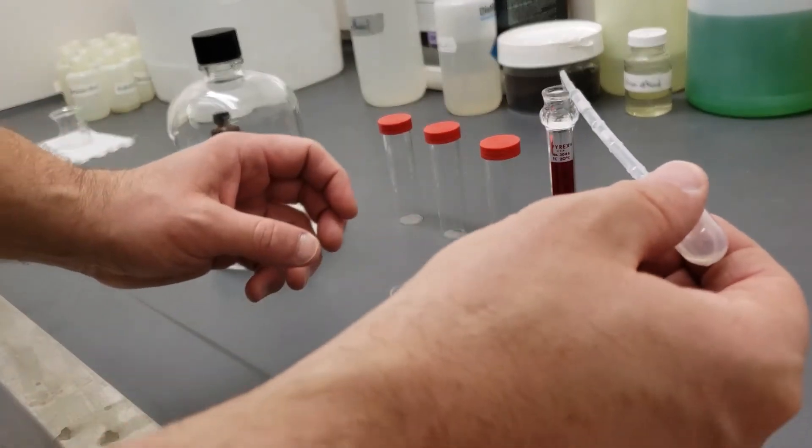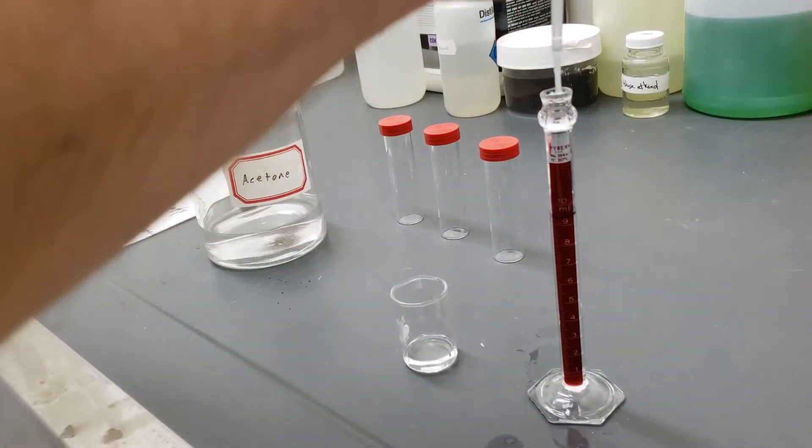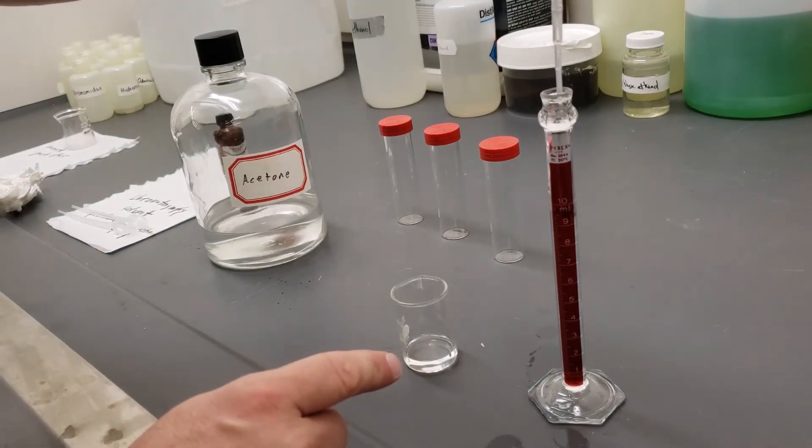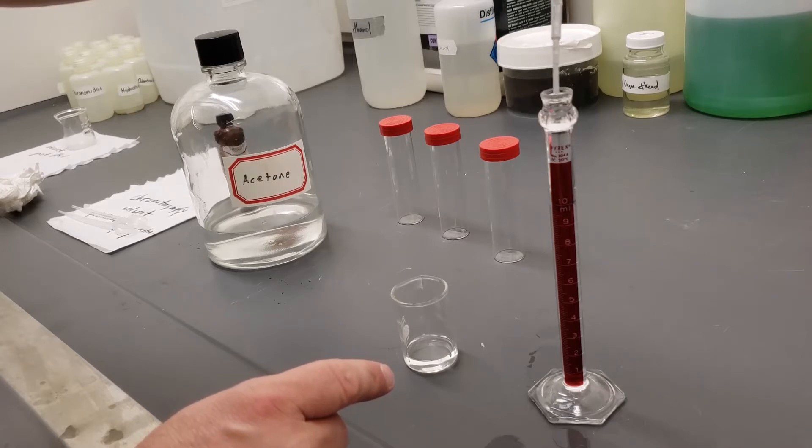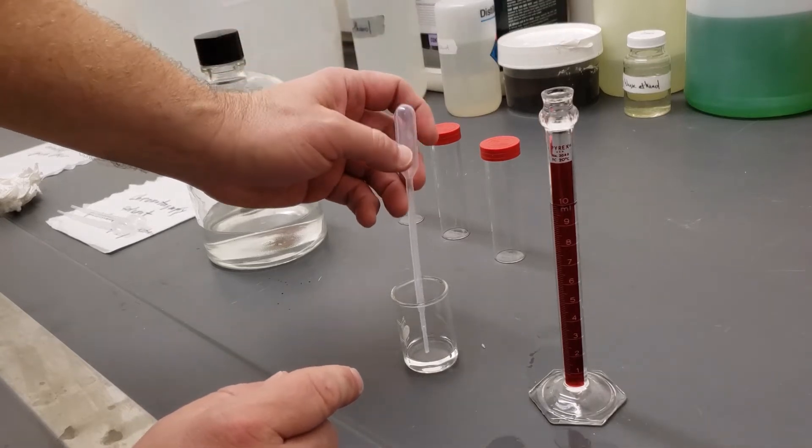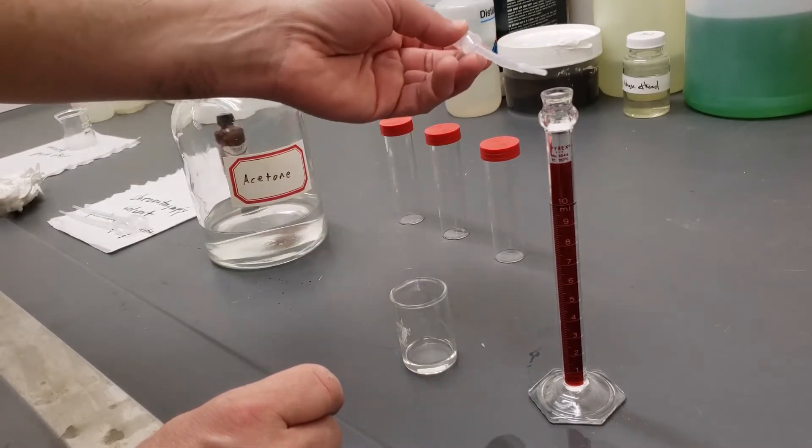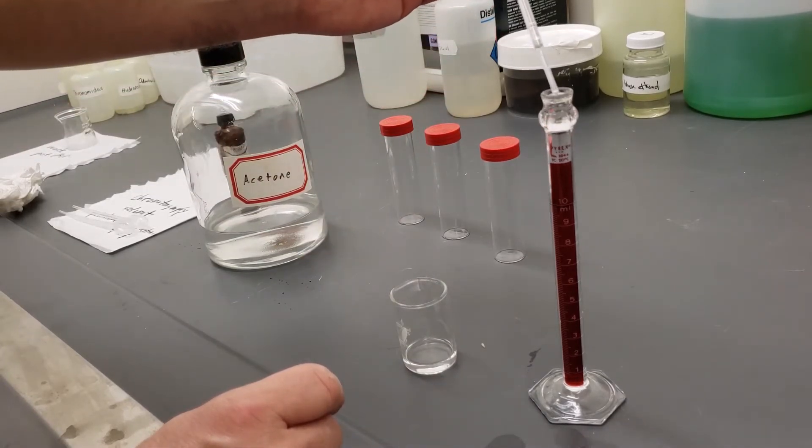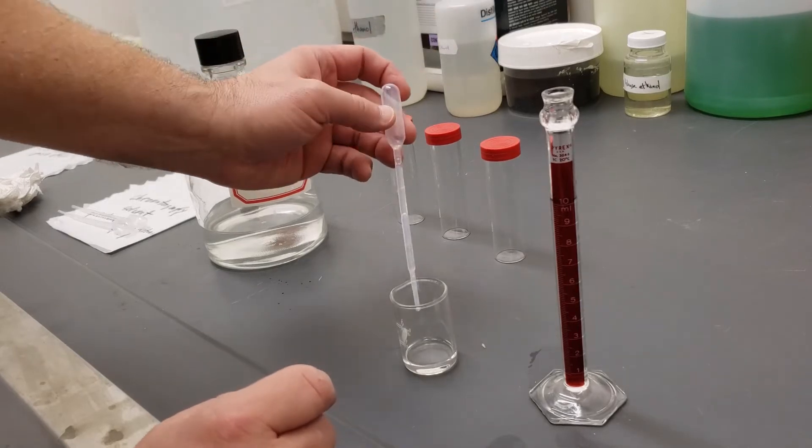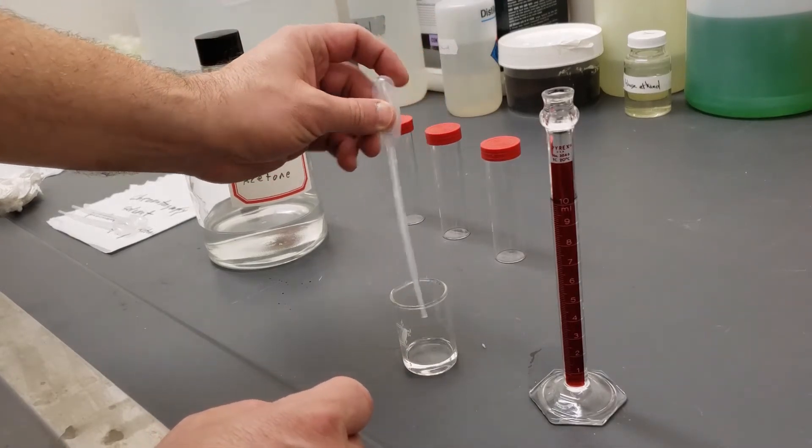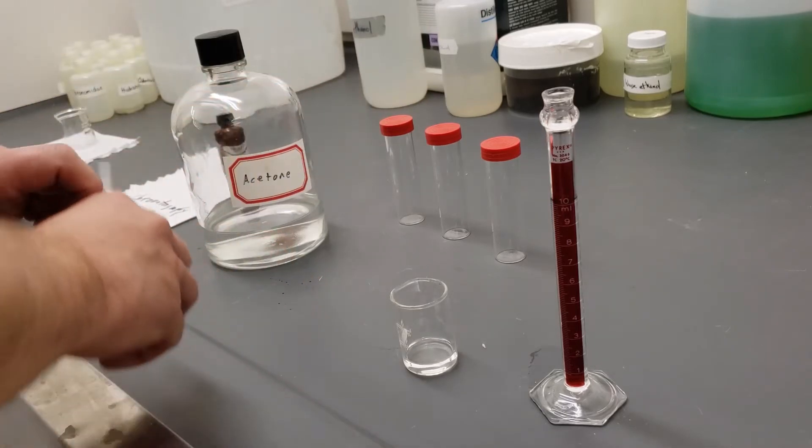Let's watch the graduated cylinder here. We're going up to nine to one. So I have nine mils of petroleum ether, one mil of acetone. That puts me right at 10 mils. So I've got a nine to one petroleum ether to acetone mixture.